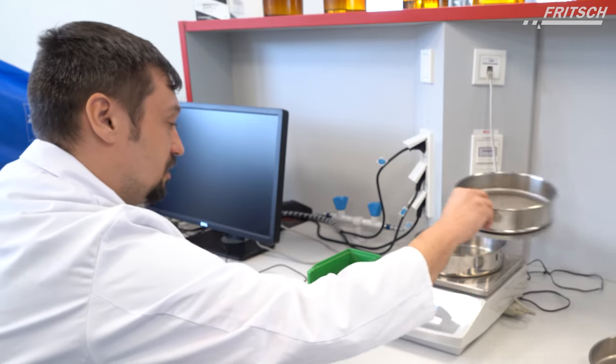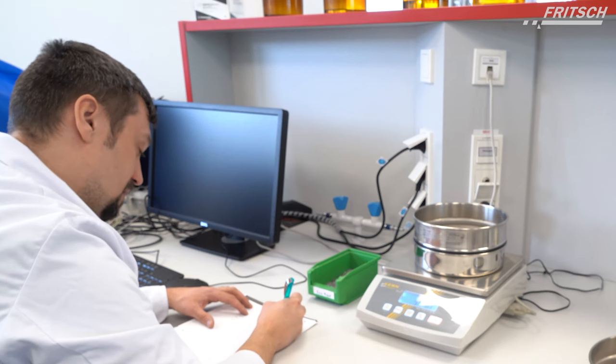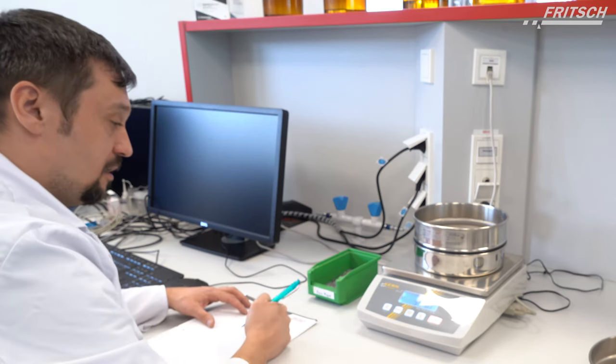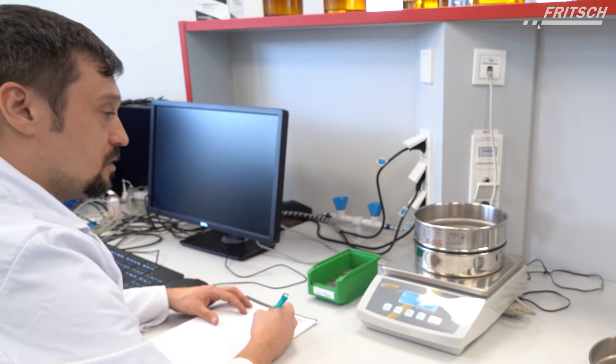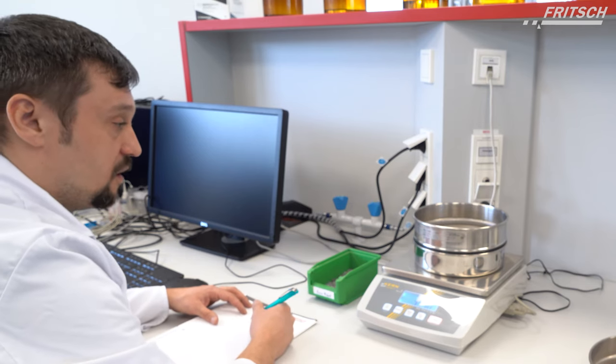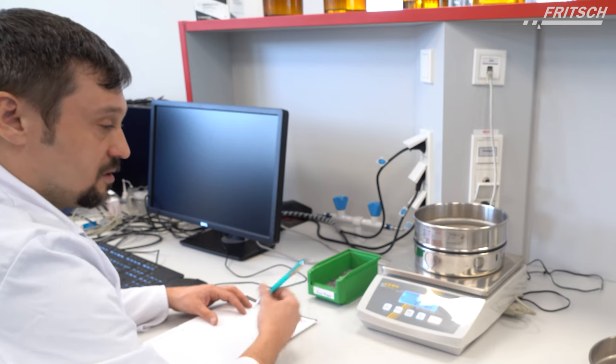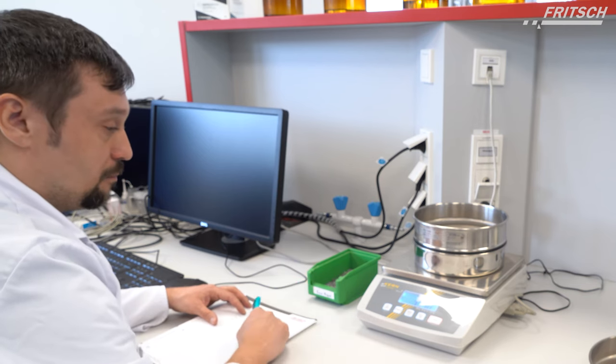Put the next sieve on top and note it again. As you can see, we also use sieving aids, which are five 5-millimeter gate balls, to help separate the sample.